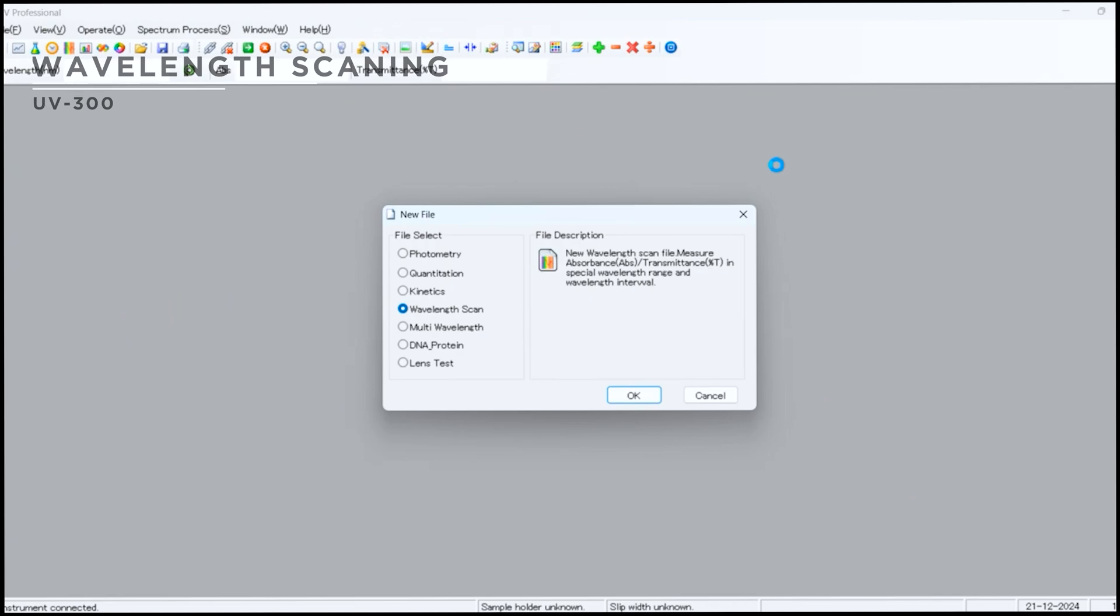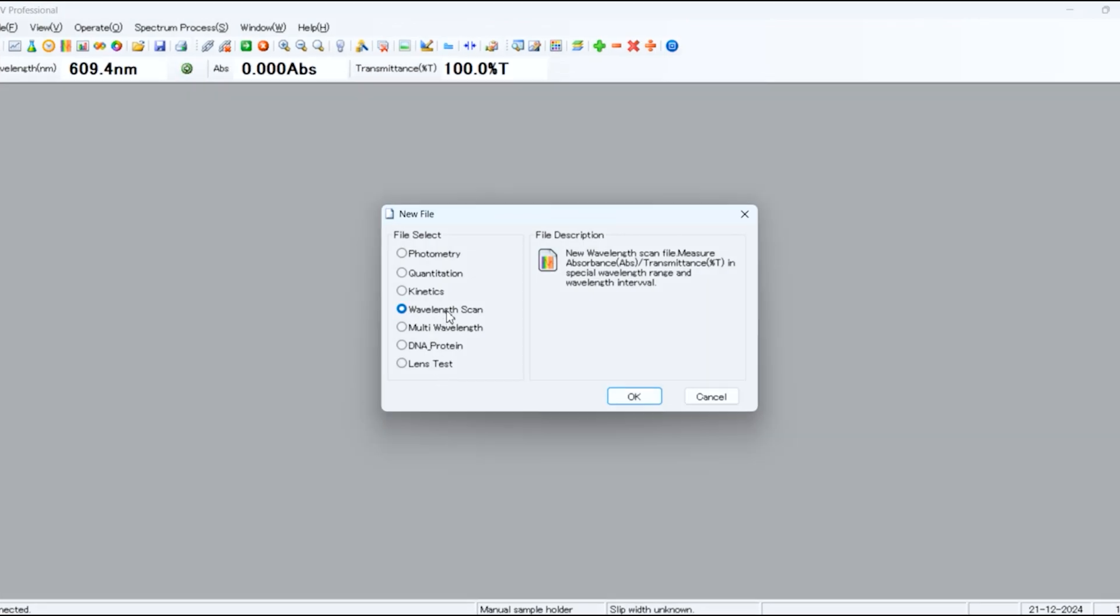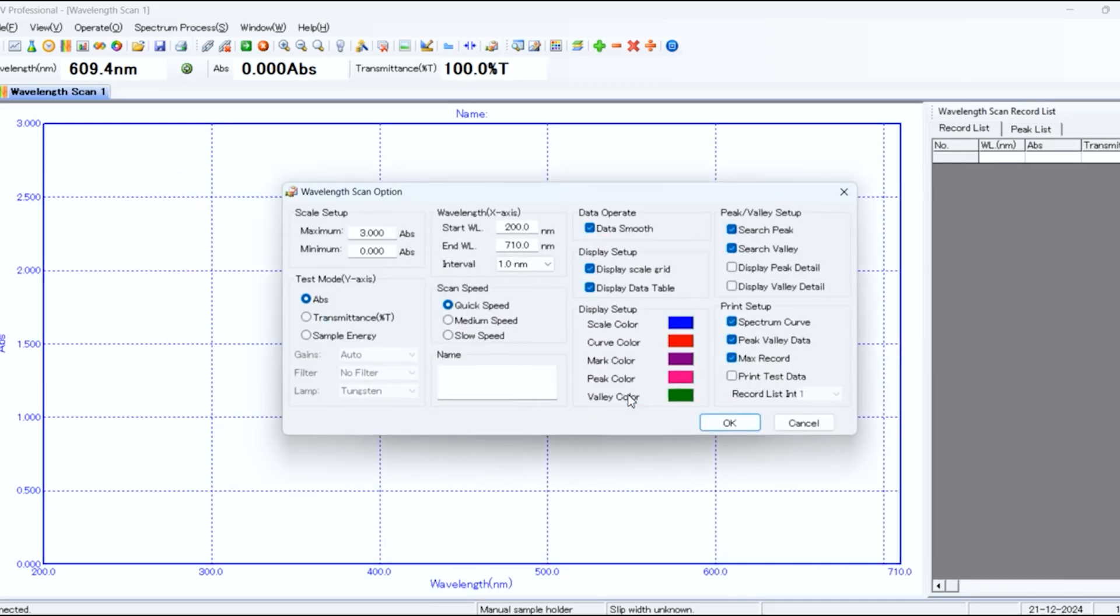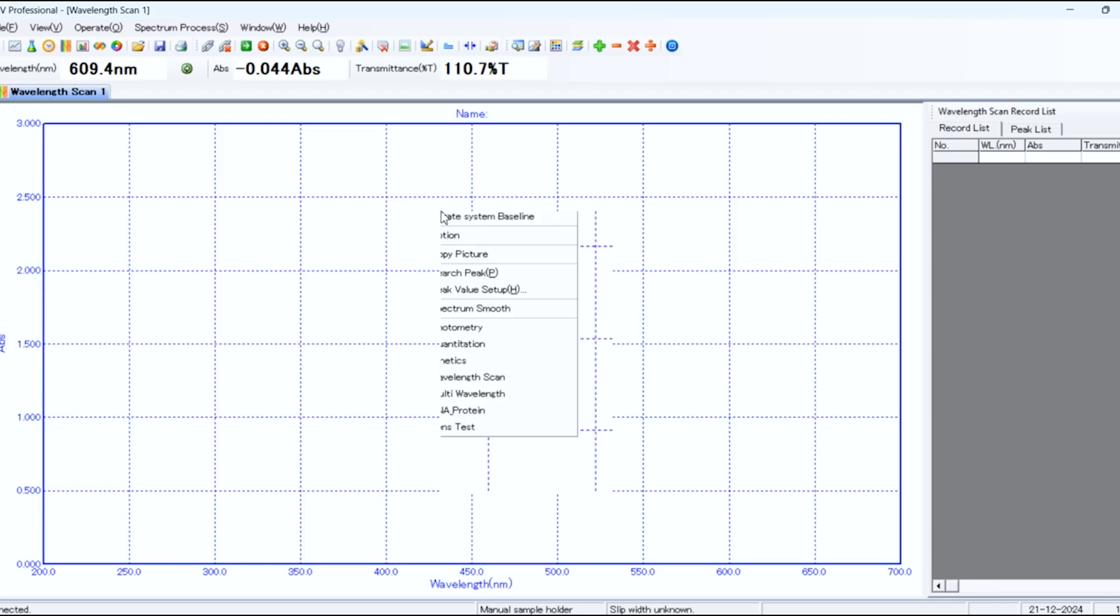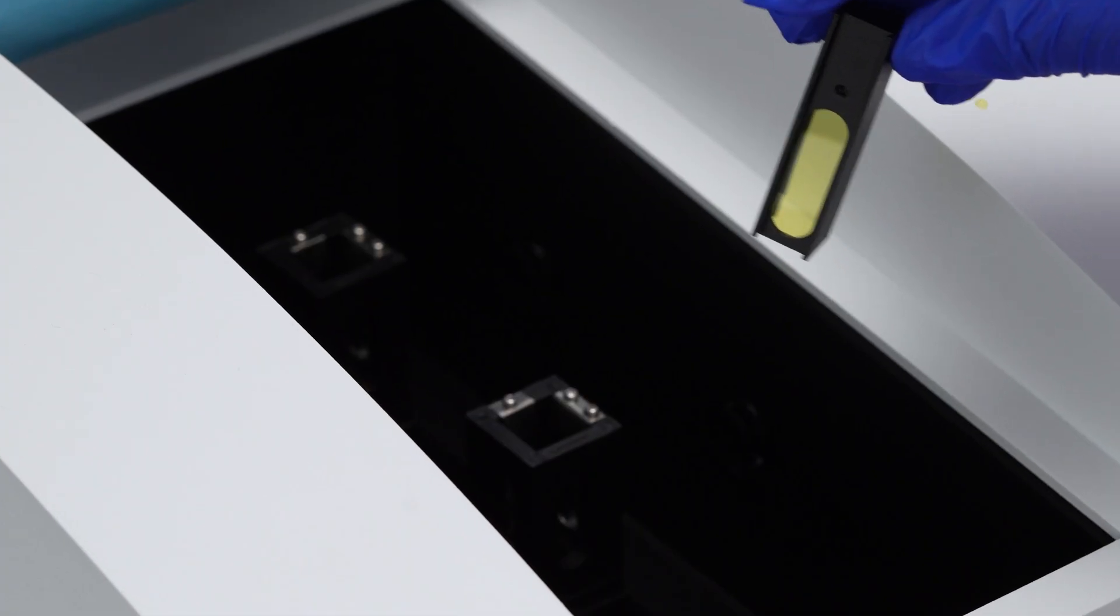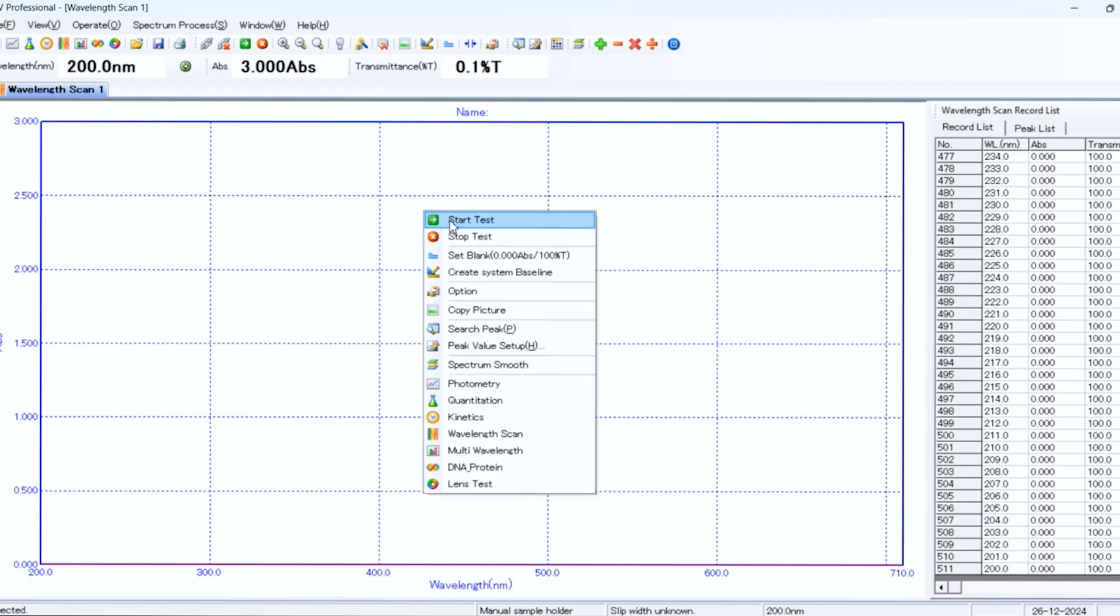Wavelength scanning measures unknown sample wavelengths. Select wavelength scan and click OK. Input the start wavelength, end wavelength, interval, scan speed and file name. Press OK. Place a blank solution in the light source. Right-click and select set blank to measure absorbance for your samples. Insert the sample such as a Holmium filter and click start test to plot the graph.